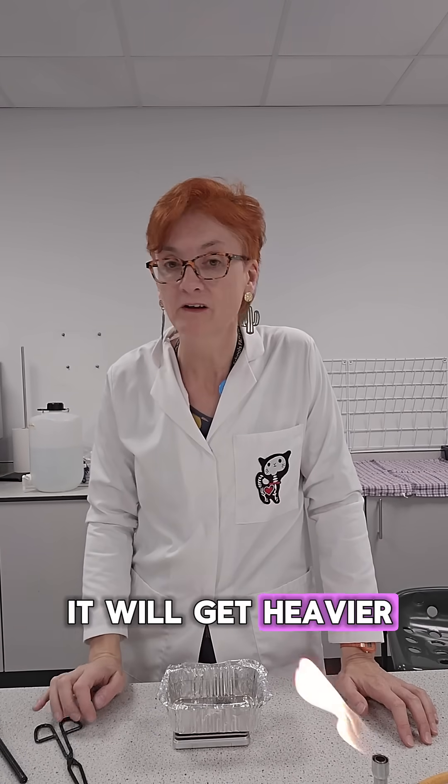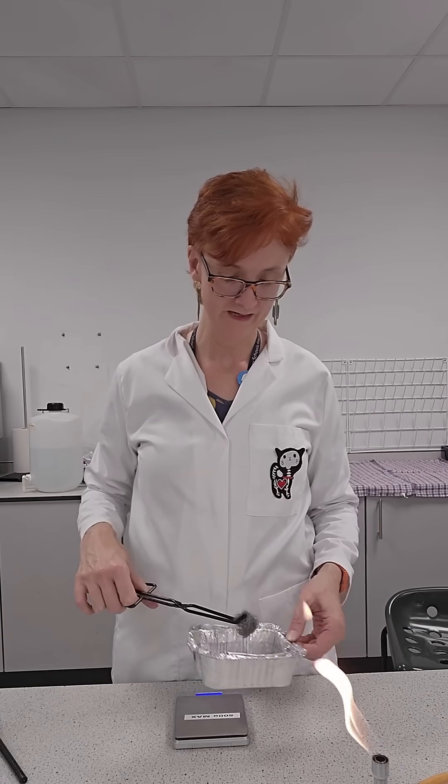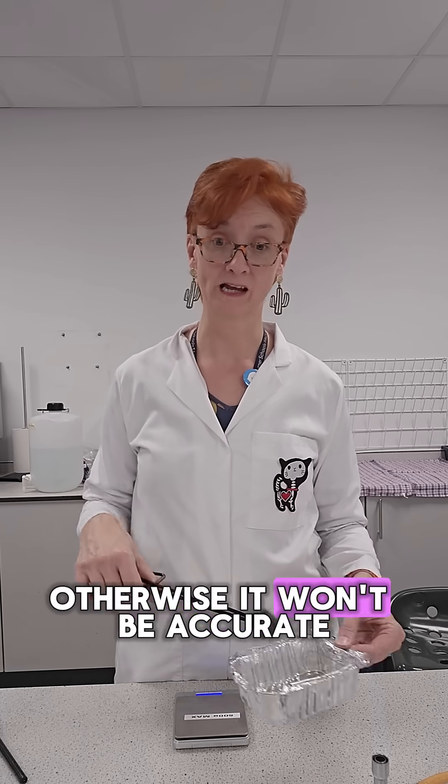Now, do you think it will get heavier or lighter if I set fire to it? Higher or lower? So now I'm going to burn it in this Bunsen. And I'm going to hold the dish there because I need to collect all the bits, otherwise it won't be accurate.